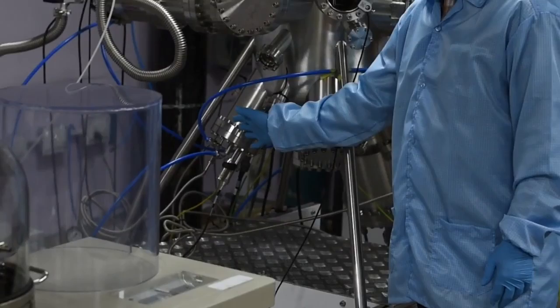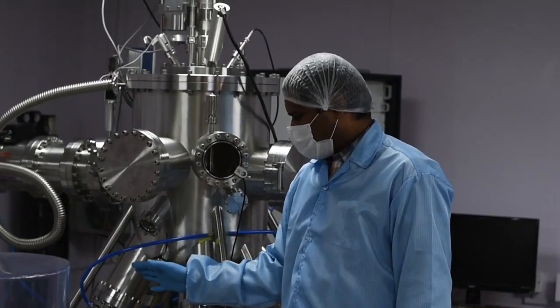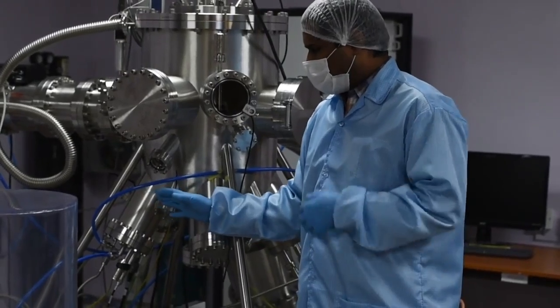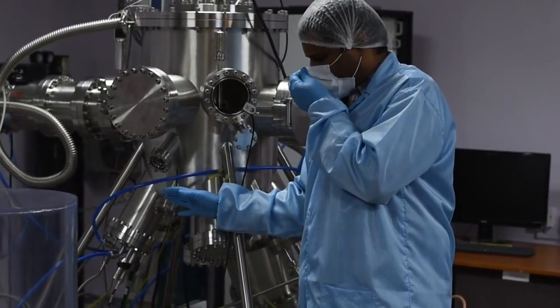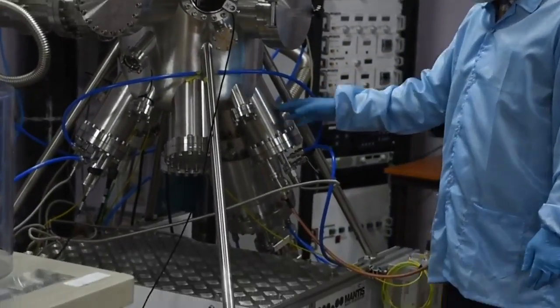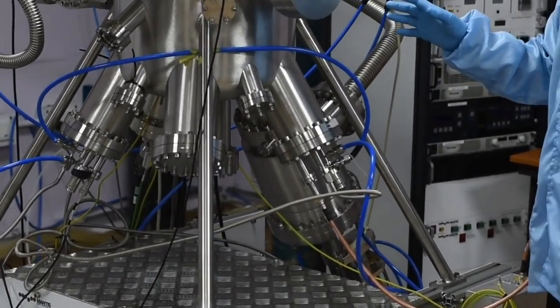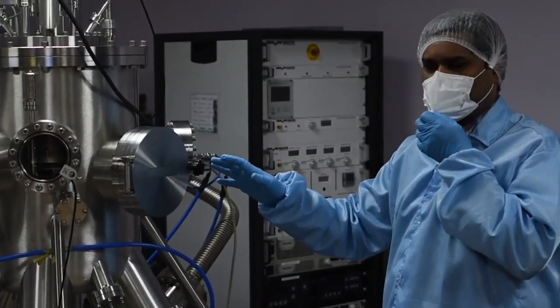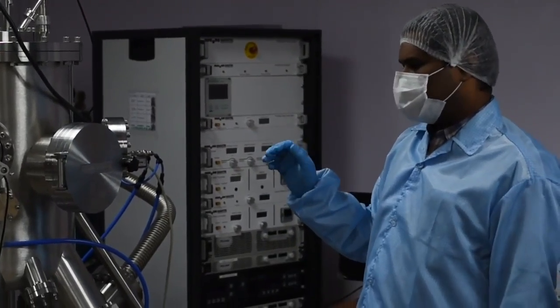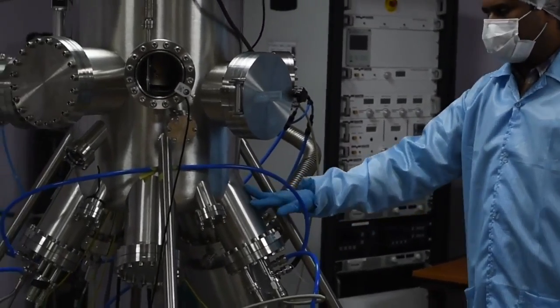DC sputtering is used for conducting target materials and it has a problem with dielectric target materials. Over time, charge builds up on the cathode or on the target, which affects the overall sputtering process. RF sputtering alternates the electric potential of the current in the vacuum chamber at radio frequencies, on the order of 13.56 MHz, which avoids charge build-up on the surface of the target at the cathode.